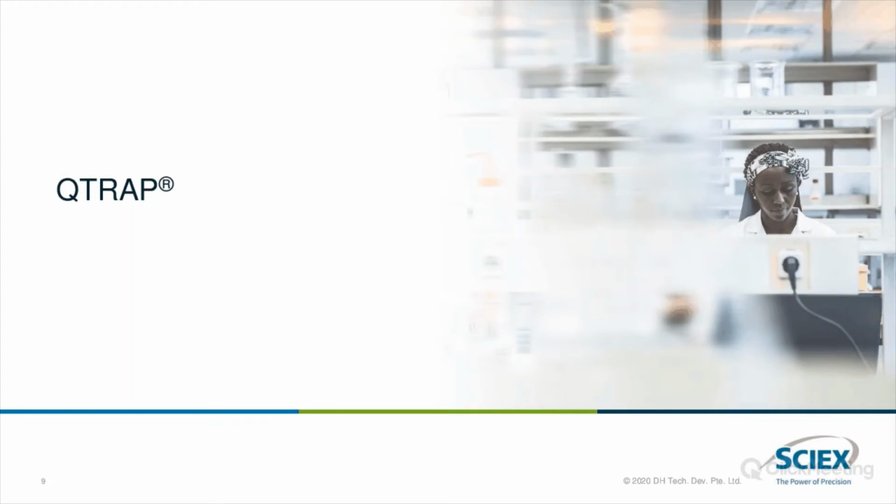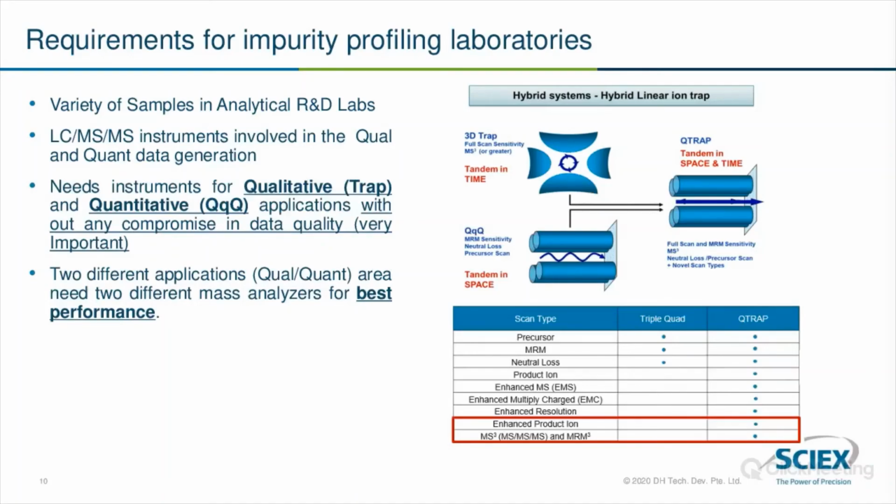I'll be giving you a little bit of understanding about the Q-trap. You might have seen Q-trap mass spectrometers, you may be using them in your laboratories, but just for the larger audience, I just wanted to tell what the Q-trap means from Sciex. So Q-trap stands for quadrupole plus ion trap, coming in a single mass spectrometer or in a single platform. And this is a hybrid mass spectrometer which Sciex invented a long time back and holds the patent for this technology. So basically this is two mass analyzers sitting in one single mass spectrometer.